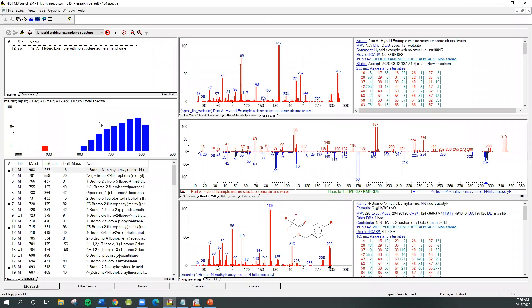Now I'd like to do a live demonstration of adding a spectrum to a user library. Let's go to the NIST MS Search program — the top one is the workspace. This is where you import spectra into the program for processing, whether you're searching for structures or in this case you want to create a user library. This is a sample that a customer has submitted and we think we want to possibly add it to our corporate mass spectral database. The first thing you'll notice is it has some information about where it came from but it doesn't have a structure associated with it, so the first thing we need to do is associate a structure with this unknown before we add it to the library.